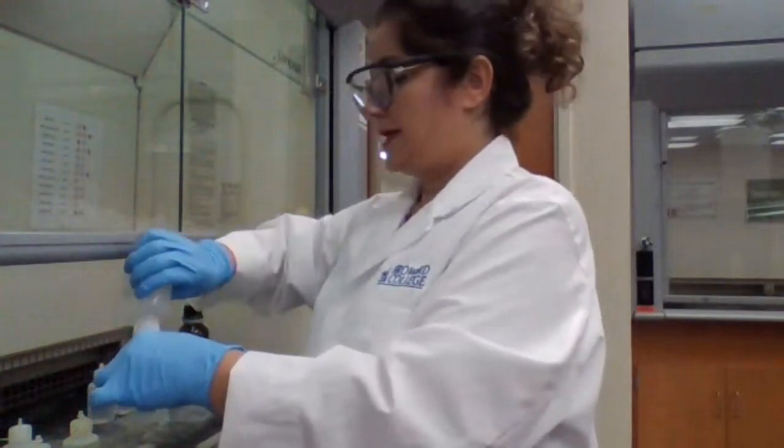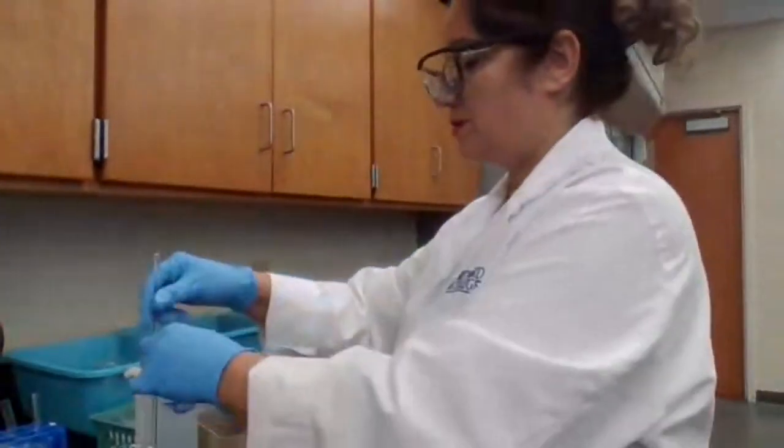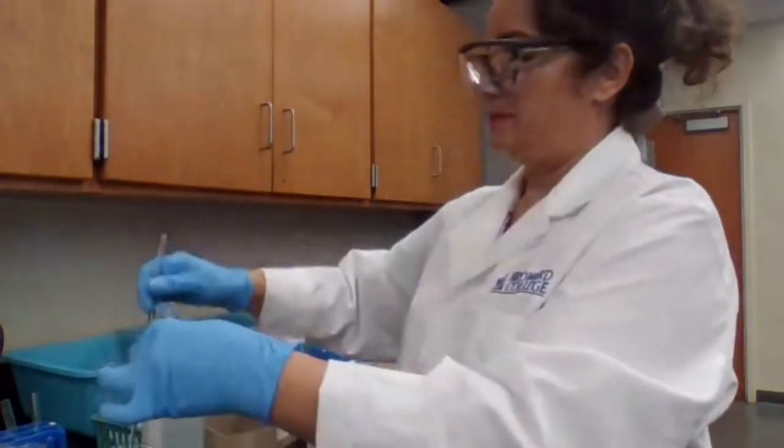Okay. So I have a basic solution. The solution is basic, and I added tin chloride, SnCl2. Going to mix it well. Wash the syringe out. Mix it well.